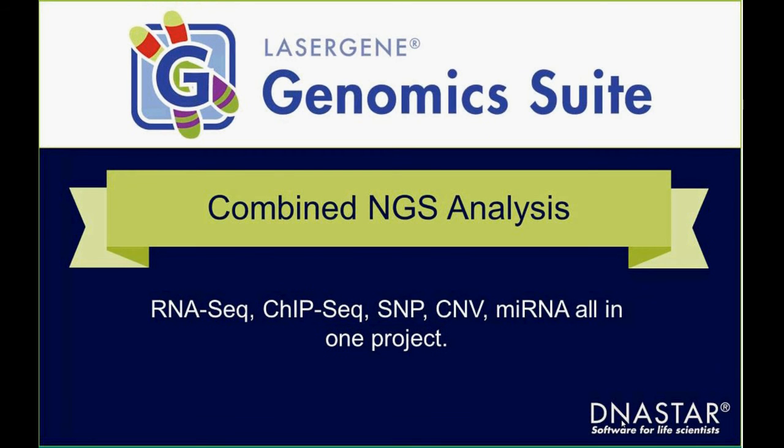Okay, so today we're going to be talking about a new workflow that we've added to our NGS tools. For quite a few years, we've had different workflows: RNA-Seq, ChIP-Seq, SNP analysis, and short RNA analysis.